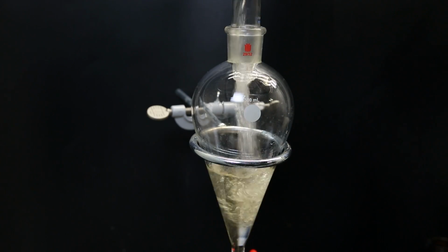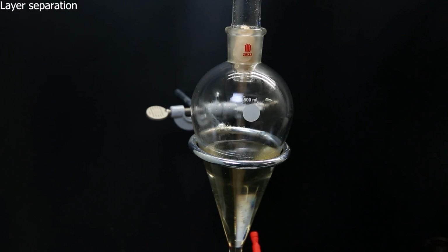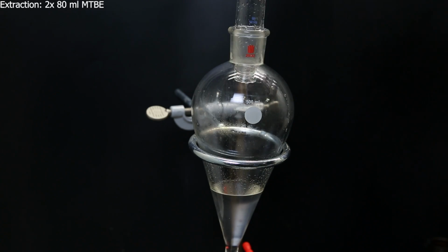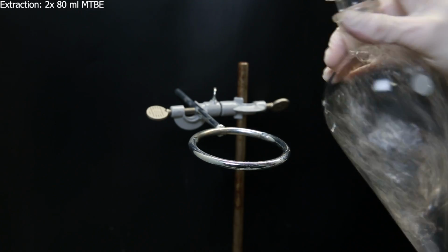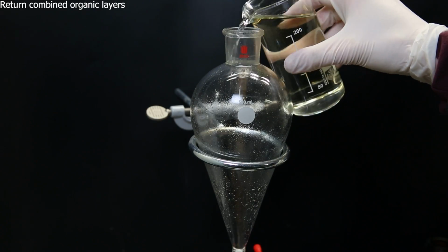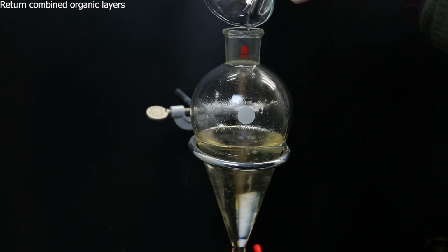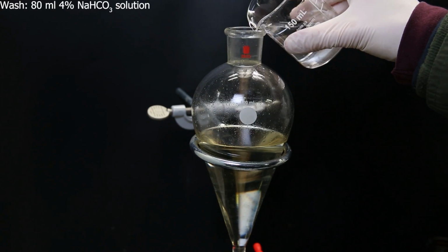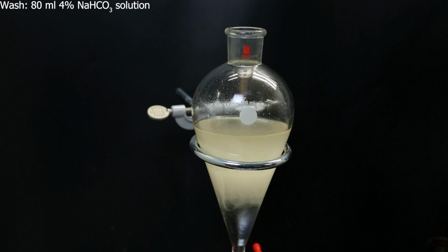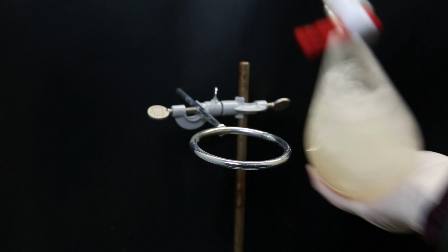I move the mixture to a separatory funnel and separate the layers. I then return the water layer to the separatory funnel and extract it twice with 80 ml of MTBE. I combine the extracts with the organic layer and then return it to the separatory funnel. I then wash it with 80 ml of a 4% sodium bicarbonate solution, which will take out some salts and impurities, while keeping the water phase basic to prevent the product from moving into the water layer.